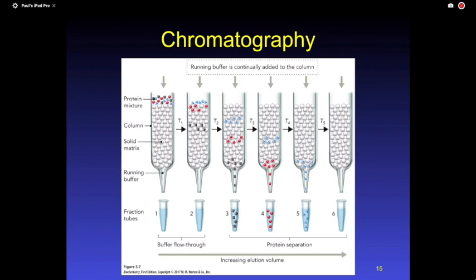Some of the proteins will run off, right? But some of the proteins are stuck. Is that where I want my protein to be, stuck on the column? No. So what in the world do I have to do? Okay, the next term that we talk about is eluting. Okay, we're going to elute.